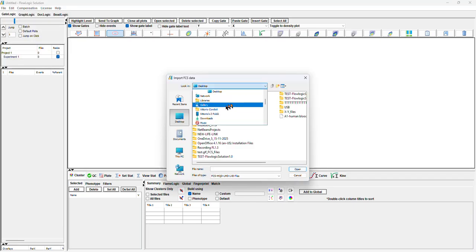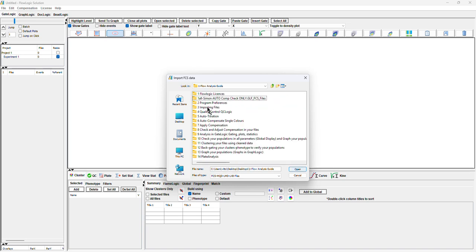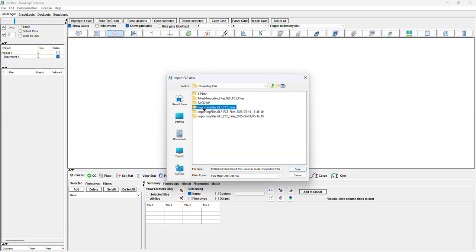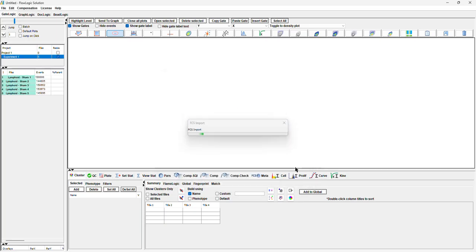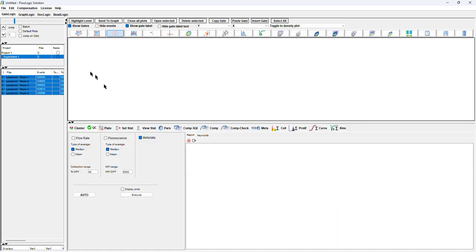We go to select one folder that contains the files. Open. Here are listed the files, and here is where we call the folder. Now, after we load the files, the first thing probably to do for the files that you load is to understand if the files are compatible, and eventually do file cleaning if you need to clean the files.